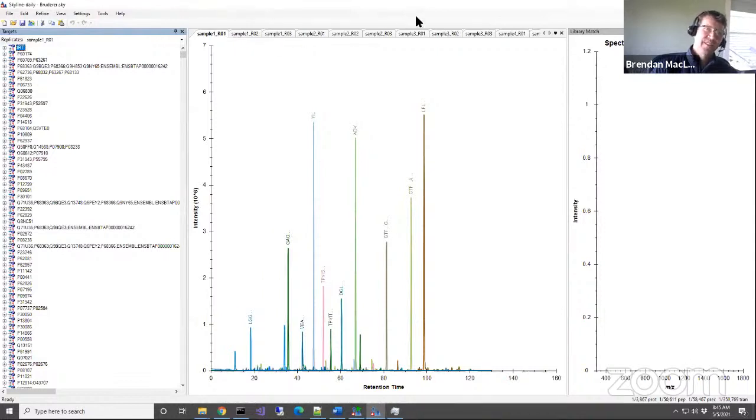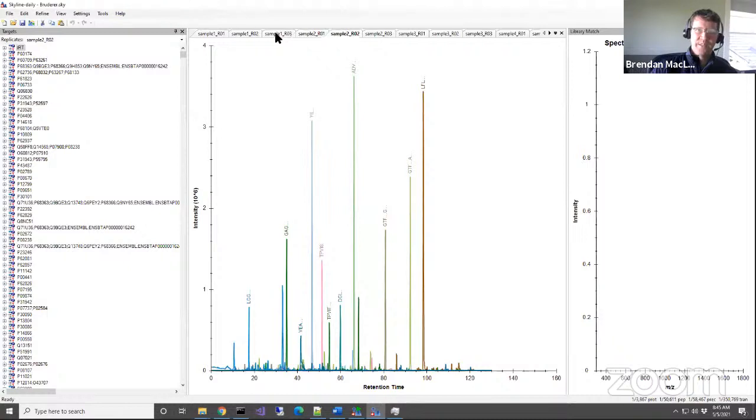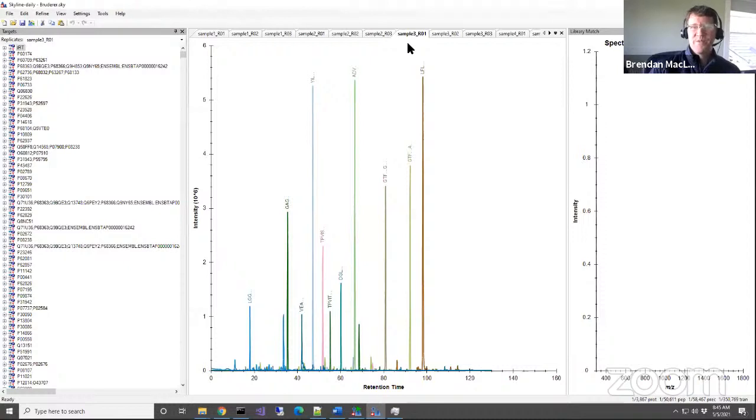Yeah, so let's talk about this, but definitely before we get into it. Here you can see the chromatograms, and you can see the various files. I think we talked a little bit about somebody asking the question of, do I need to look at every peak to process this?